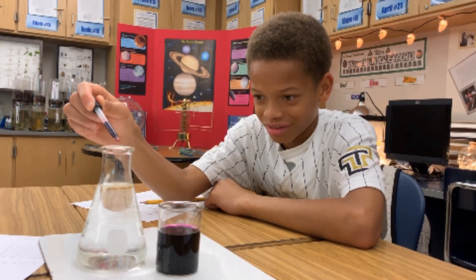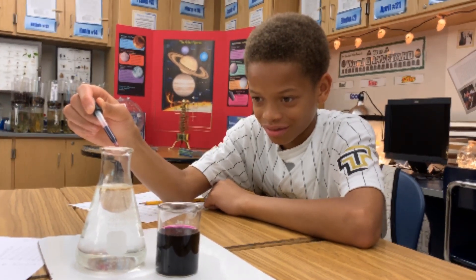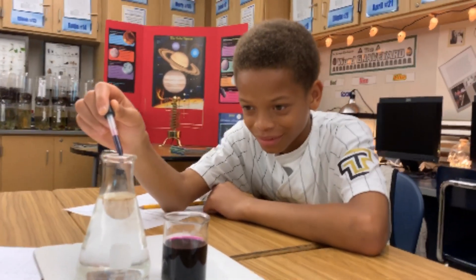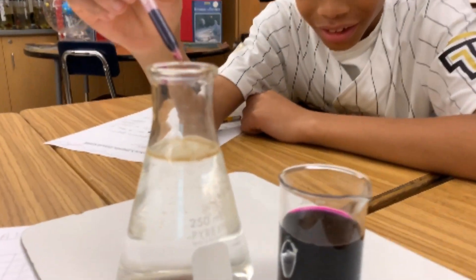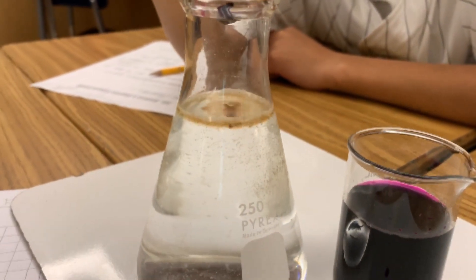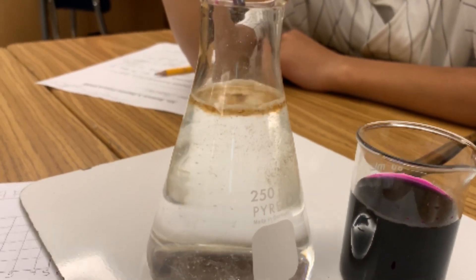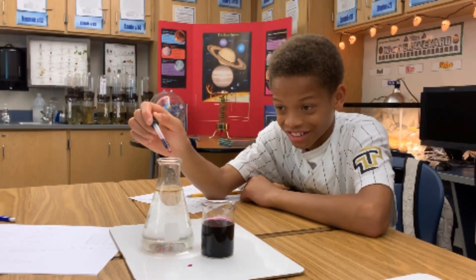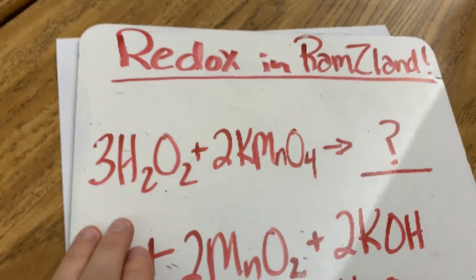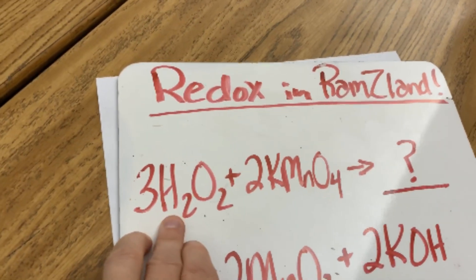Watch it carefully. You see it's bubbling up. Do you see bubbles? Yeah. Okay, keep adding it. Now why isn't it purple? Where does that color go? It evaporates? Oxidizes?